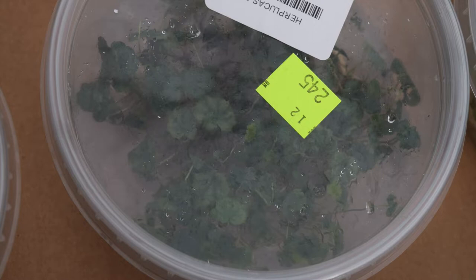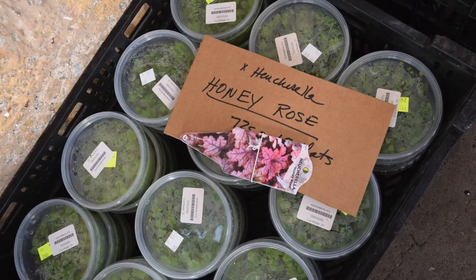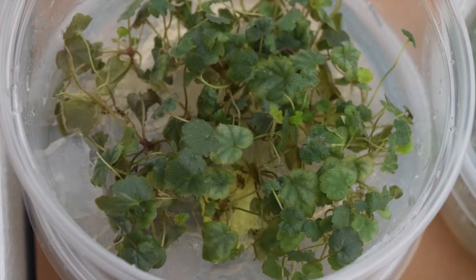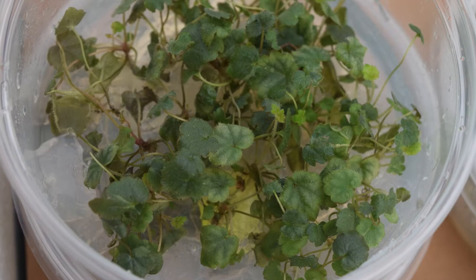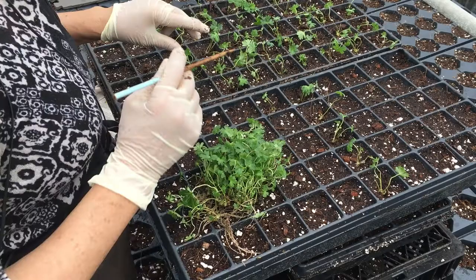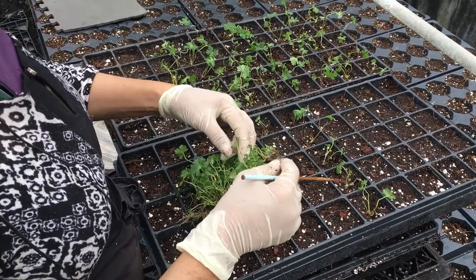Inspection of the contents of these tubs is critical. Disease or damage in transit will need to be claimed with the lab, and these tubs have to be transferred to a suitable carrying container for greenhouse production. Once the tub has been opened, it should be planted promptly, as delays at this point will cause plant desiccation. Transplanting by hand is frequently used by propagation companies, and using a bamboo dibble stick, the plantlets are put into the potting media. This has proven to be a successful method.